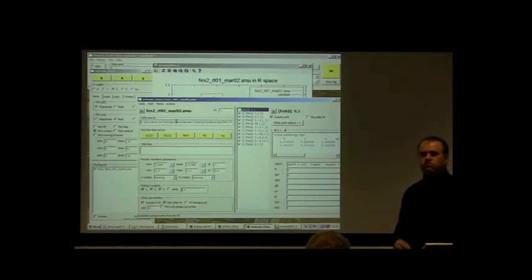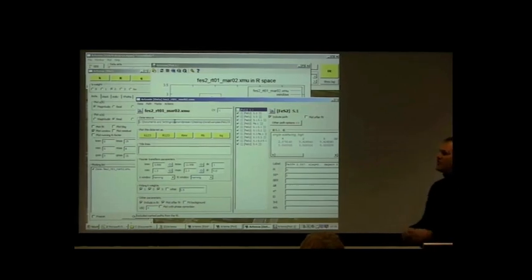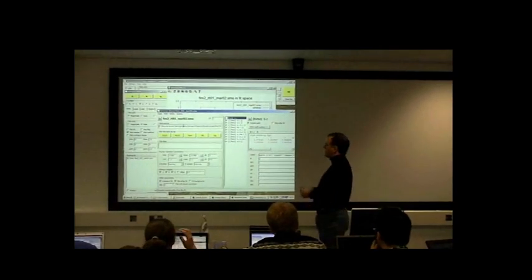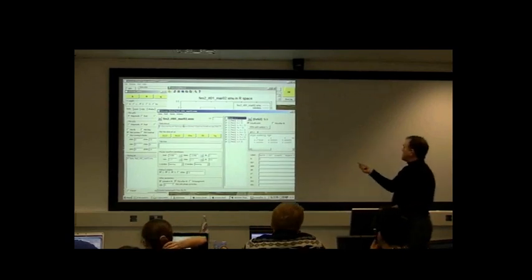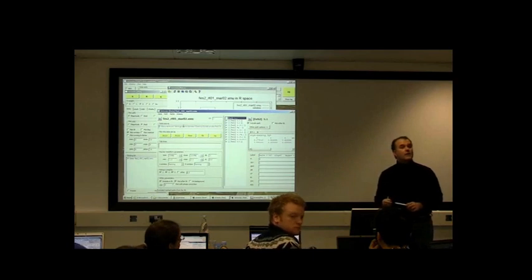I should have stopped when I asked you. Now I have trouble seeing this finishing in 5 minutes. So I actually think we should take a break now and come back to this after lunch. So after lunch I'll start to talk about how to do the parameters of the fit so that we can be ready to hit the big button up here and actually do some data analysis. Said we're not ready. Oh, lunch isn't ready. Yes. Oh, so I should keep talking. Yeah, 10 more minutes.